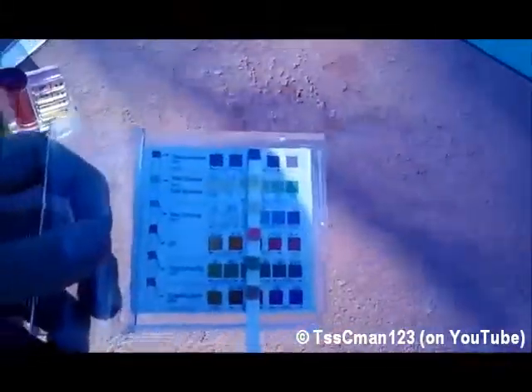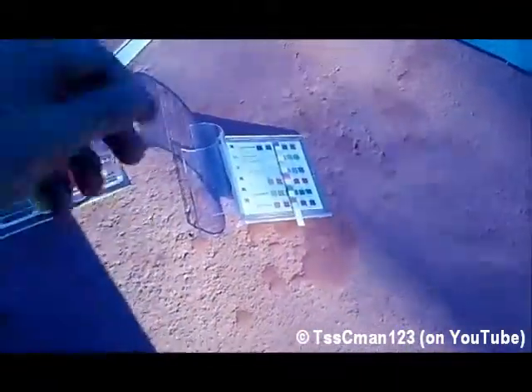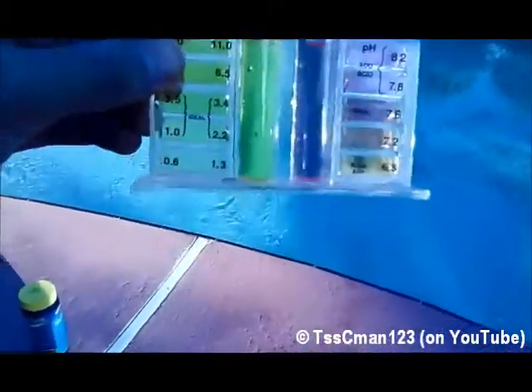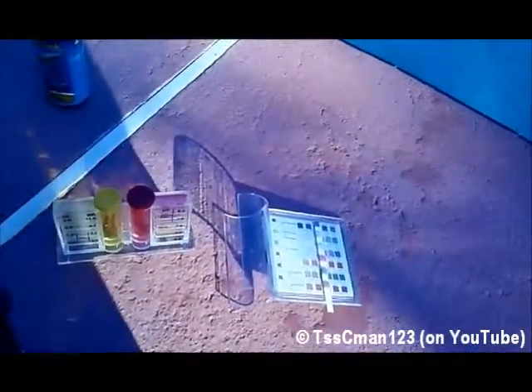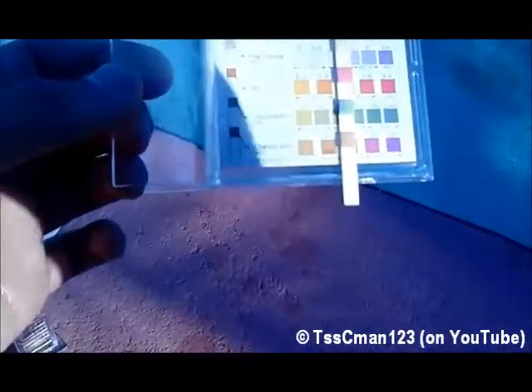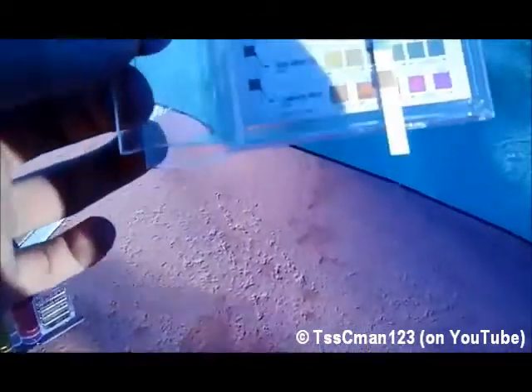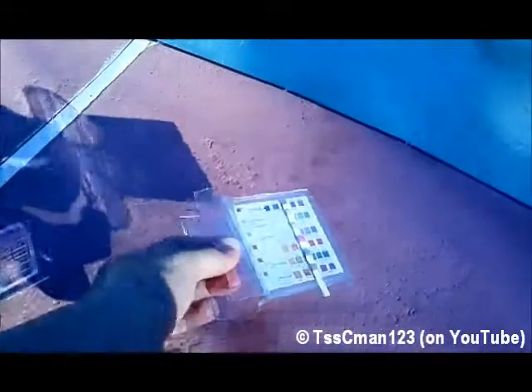As for the test strips, they are constantly changing colors and they're very inaccurate. Even though I said earlier it was reading 2 for the total chlorine, comparing to the kit it can be a different story. The 0 and the 50 for stabilizer are both basically the same color, and that's a big gap. Basically, with the stabilizer it won't tell you until you have too much and by then it's too late. Test strips I would avoid.